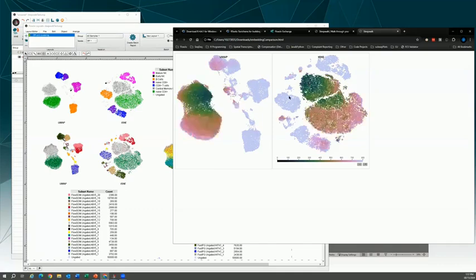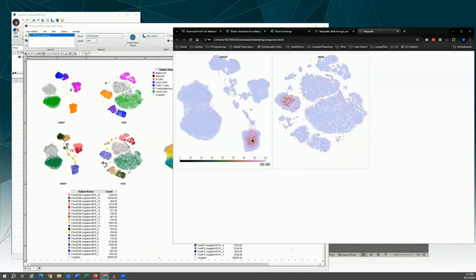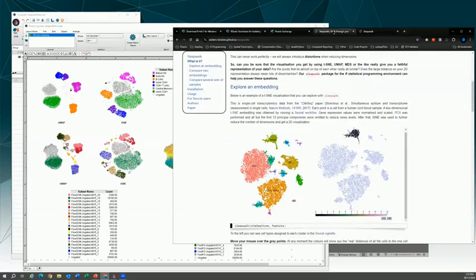Anyway, really cool tool. I hope to build this into maybe a separate tool or a feature added to some of these embedding tools to get an idea of how well the embedding represents my data, and then compare that to your clusters. Again, it's called Sleepwalk.